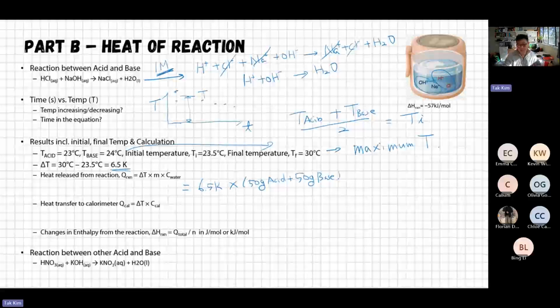Without mixing these together, you won't be able to see any heat from the reaction. But when this system starts producing heat, the energy goes into the entire system. Because of that, mass needs to be the total mass.